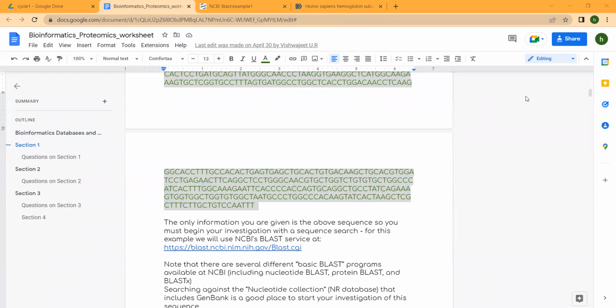So here you have original mRNA and mutated mRNA. So this is how you will get mRNA sequences for the original gene, to which your protein or nucleic acid belongs, which you will be using to compare.